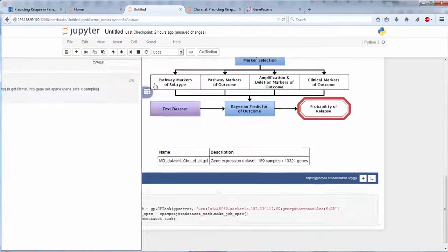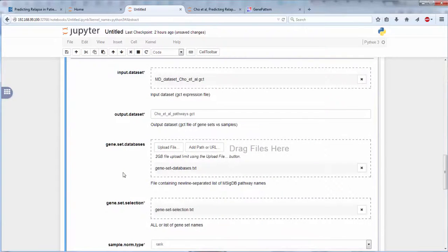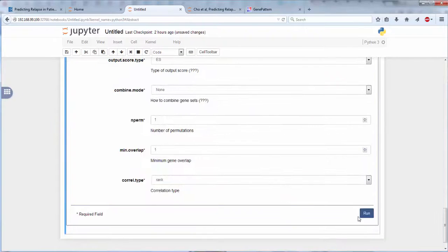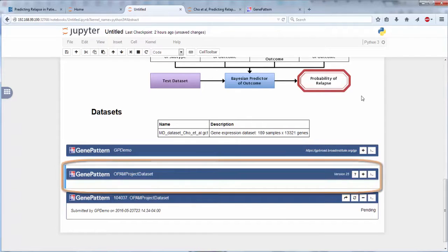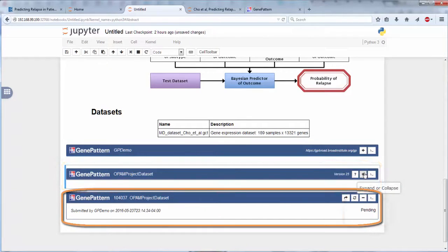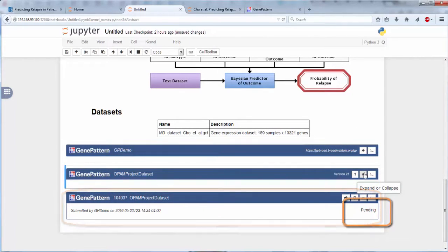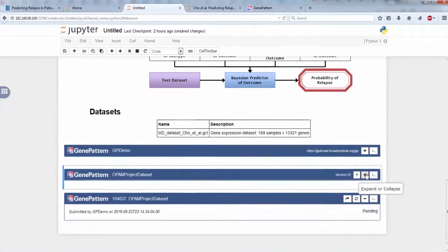We then fill in the necessary parameters and datasets, and click Run. This will collapse the cell where the parameters were entered, and create a new cell where the status of the job, and then the job results, will be displayed.